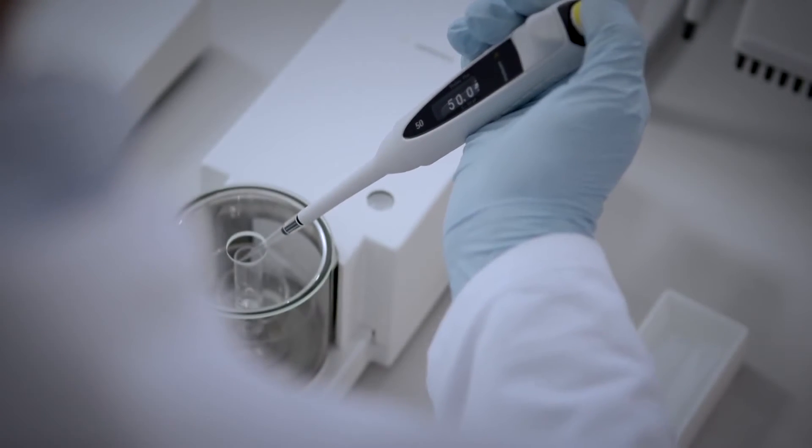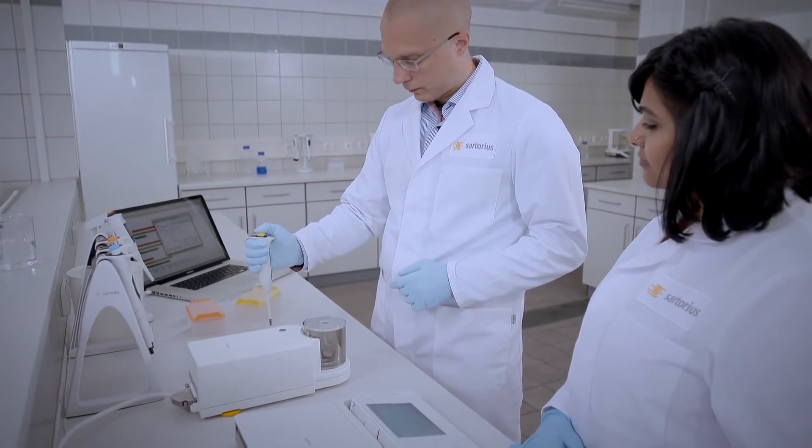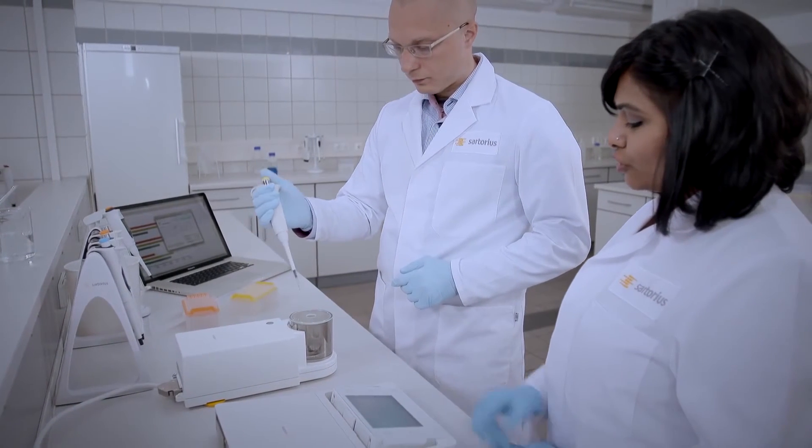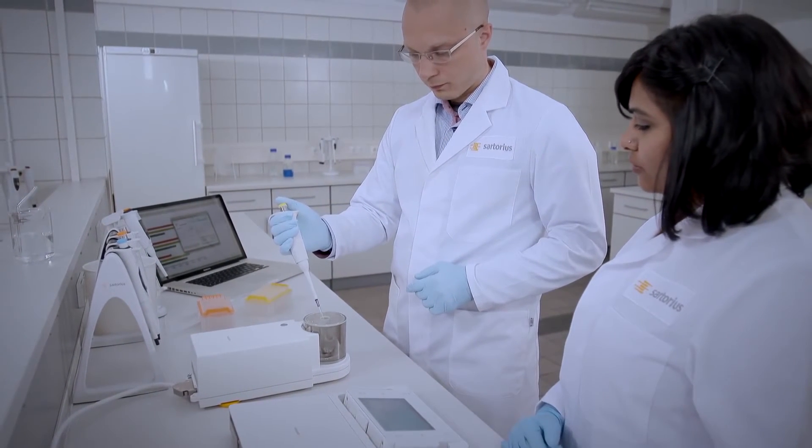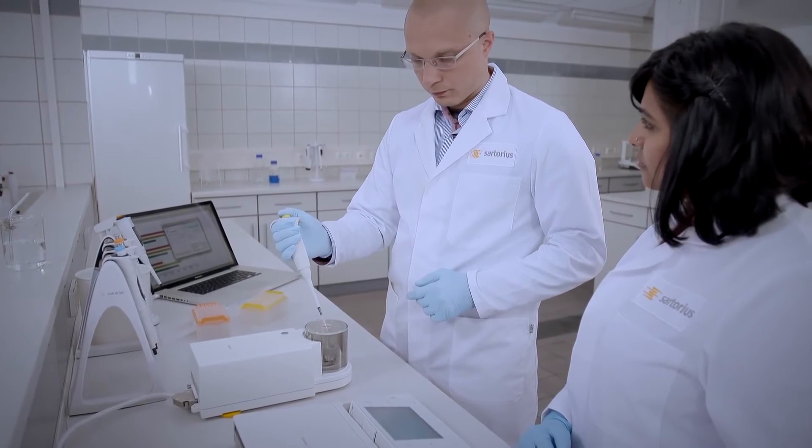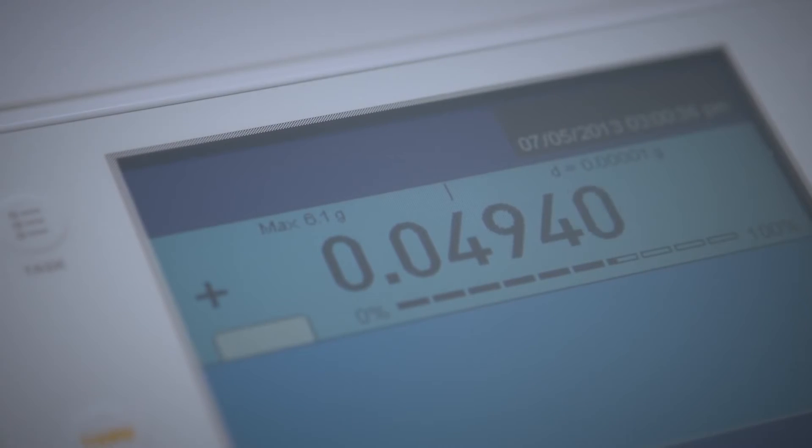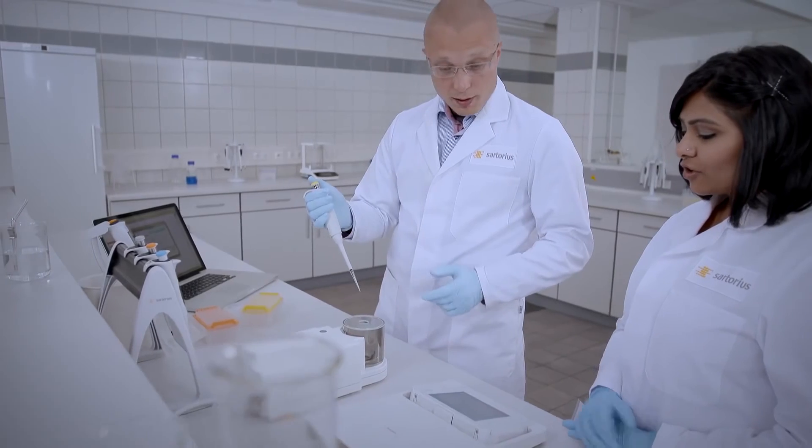Besides accuracy, the pipette is measured for precision or the distribution of the dispensed volumes. The most critical factors affecting precision are the calibration environment, repeatable procedures, and the personal skills of the calibrator.